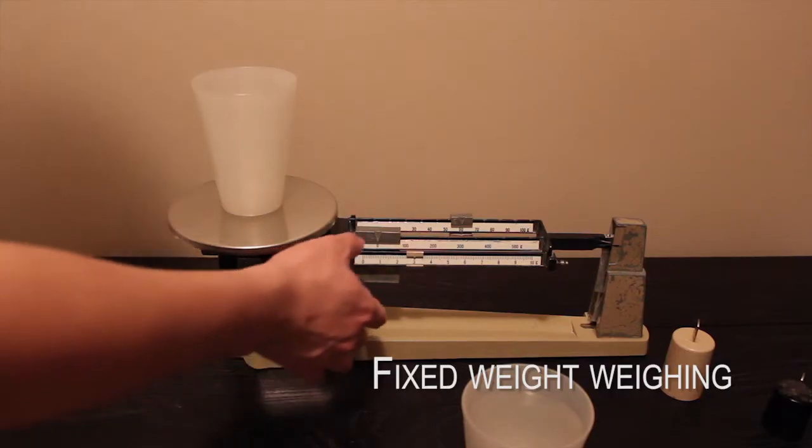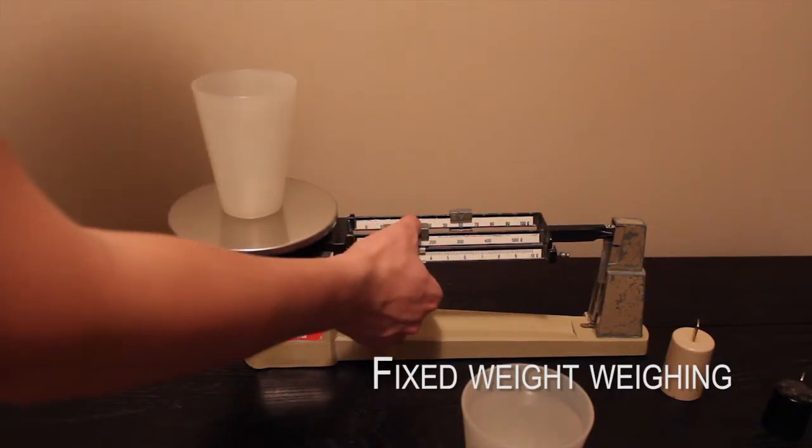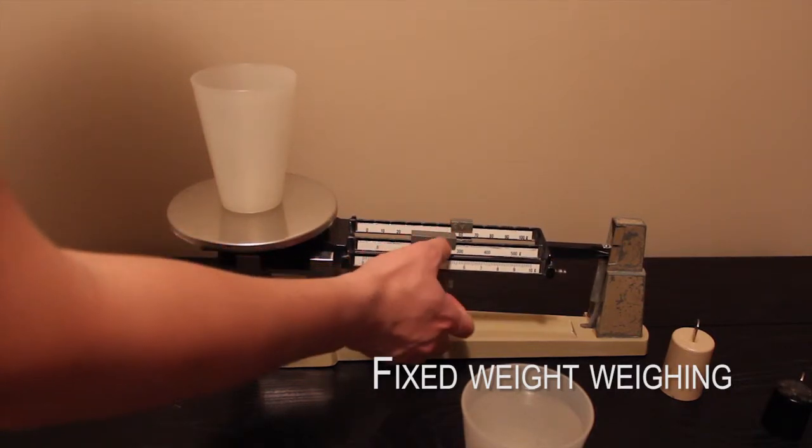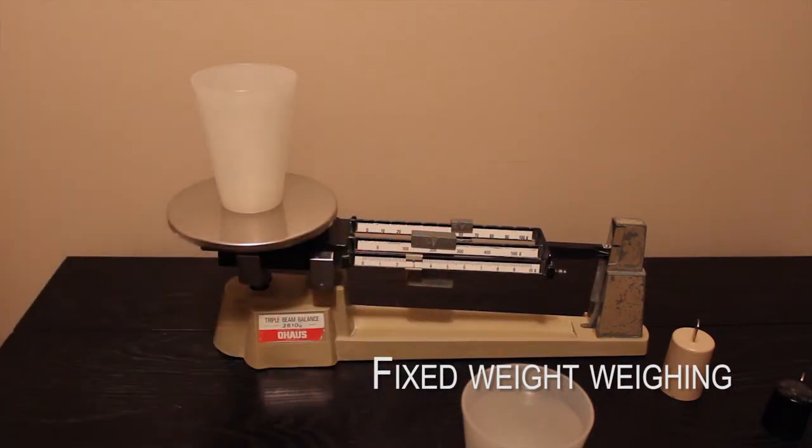Another way to use the scale is to have a fixed measurement, and to pour the powder, capsules, or liquid until the balance pointer is fixed to the middle point.